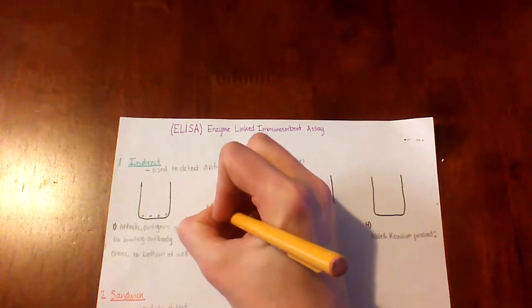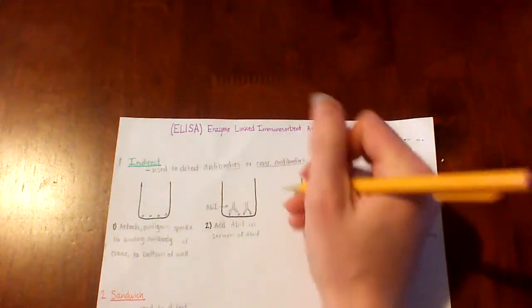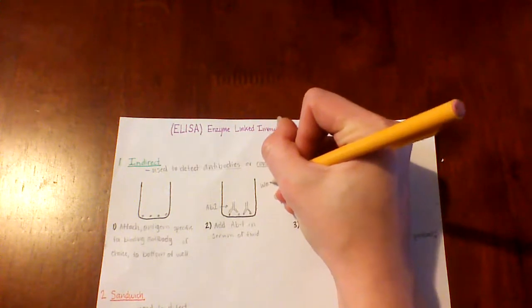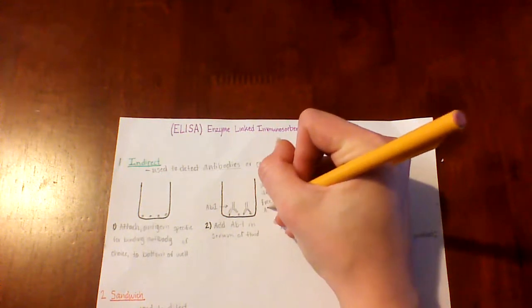So these are antibody 1, the primary antibody. So in between steps, wash away any free antibodies that may be floating around in the well.